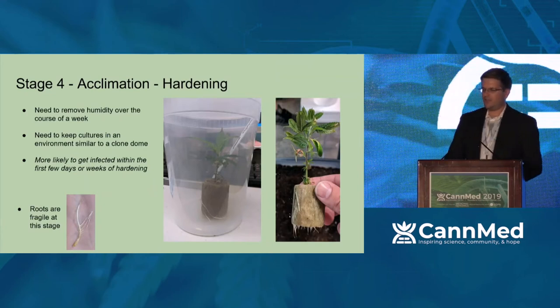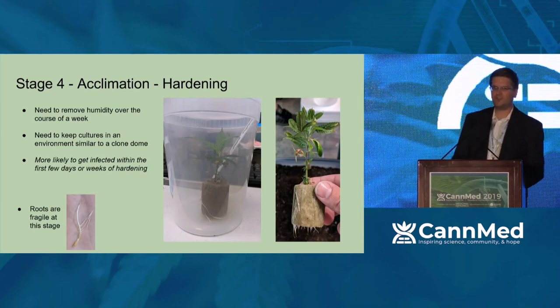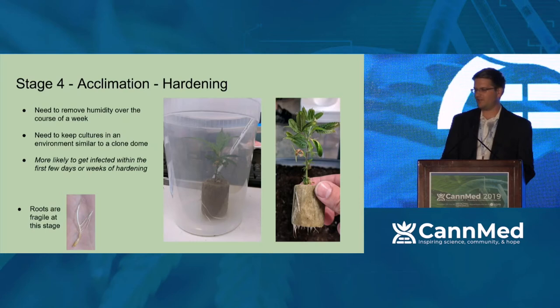The hardening stage is fairly simple, but I've seen a lot of people struggle with it, and it's just a matter of removing the humidity over the course of a week. So what you see here is just a soup food container, nothing insane, where I just shoved a Grodan rockwool cube with a plant inside of it, and slowly over the course of about a week, I let it harden off, and it worked great.